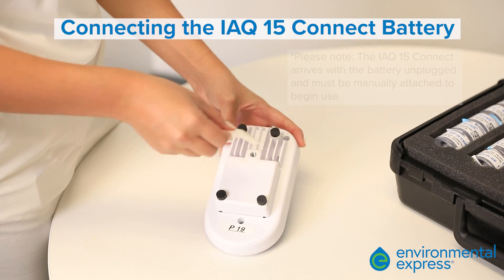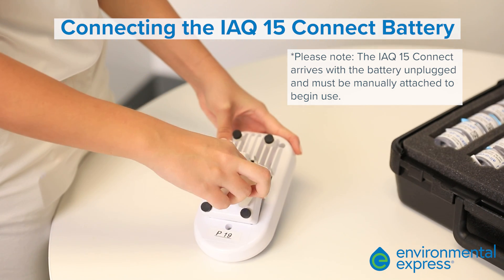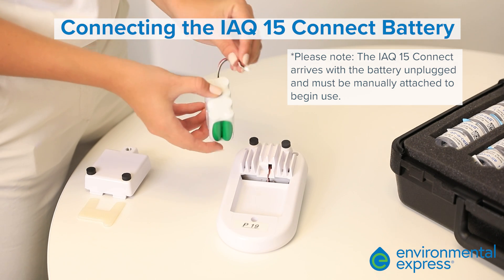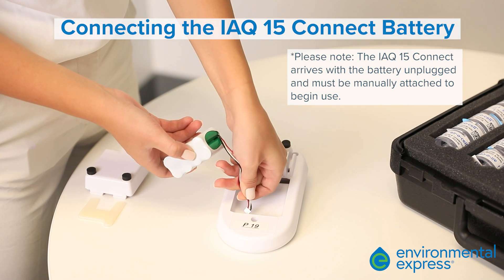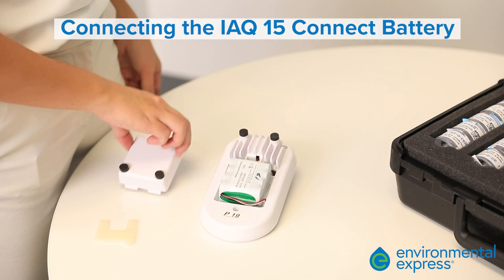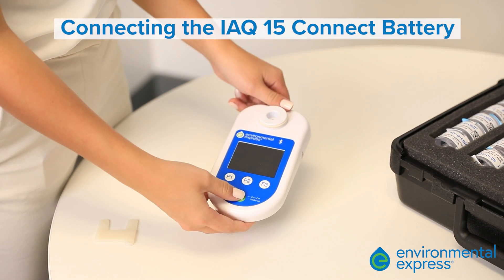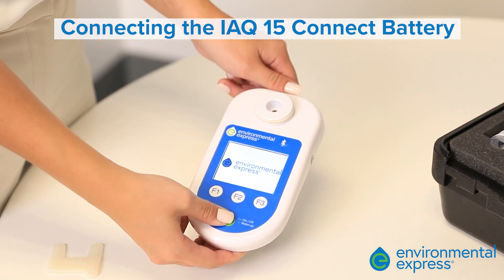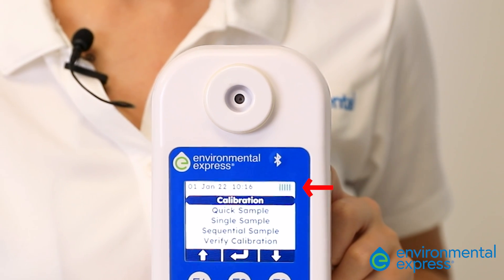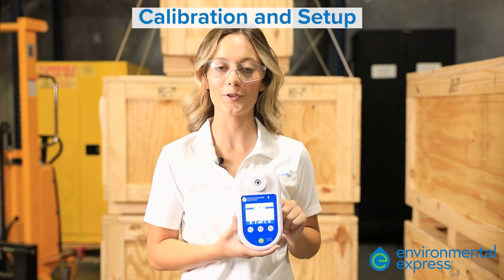Remove the back battery casing using the battery replacement tool. Take the battery from the case and plug it into the outlet in the back of the pump. Replace the battery cover and power on the device. Charge the unit to full capacity before deploying to the field. Once assembled and charged, we are ready to start using the IAQ15 Connect.